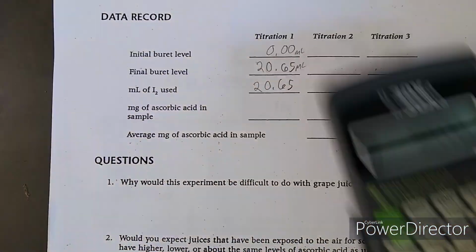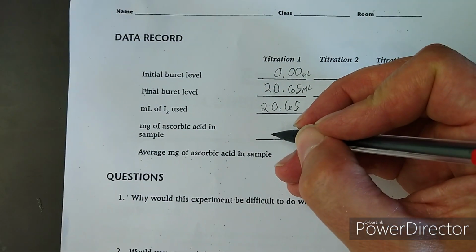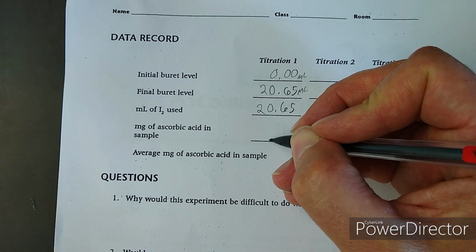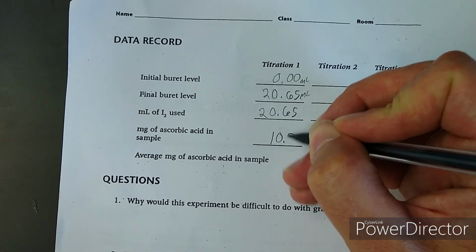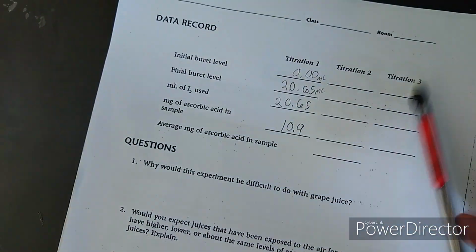Equals 10.9. Technically, we can only keep 2 significant figures on that, but I'll keep 1 to avoid round-up error for now. 10.9. That's milligrams of ascorbic acid. Now I need to do this 2 more times.